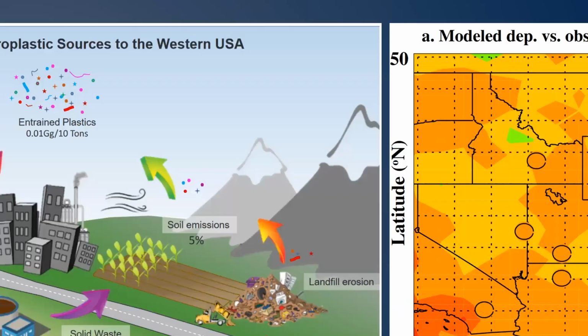The last thing we've been working on more recently is trying to understand microplastics. Microplastics are really readily accessible by Raman and IR. One of the challenges, as with all things with Raman, is that if you have fluorescence, it can be a real challenge, and a lot of atmospheric molecules have a tendency to fluoresce. That's part of why we've been chasing the OPTIR, to see if that can help us get around that issue. Microplastics in the atmosphere have actually been getting a lot of interest in the last couple of years.